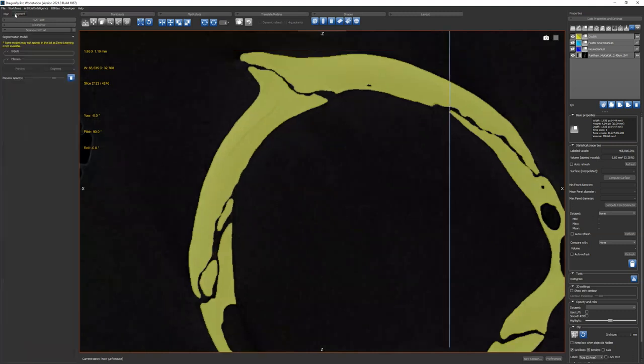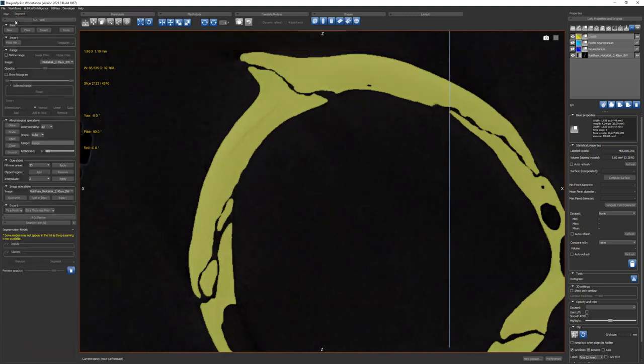So I'm actually going to turn off the 3D, and I'm going to dilate this by the smallest step possible, which is 3. Because I don't want just the edge, I want also a little bit beyond the edge. Because what we're doing is actually we're going to make a volume just like this, the same kind of file, but only the segmentation. So this is what we want.